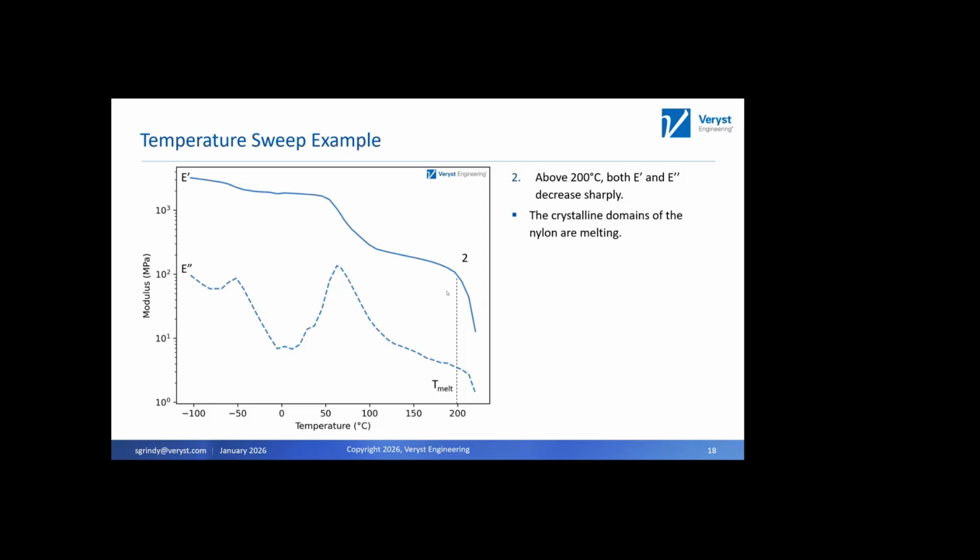It's only when you're doing very, very thin or very compliant materials that you start to have inertial effects that start to wash out your signal. So at higher frequencies as well is where that's a problem. But that tends to be, in my experience, what I'm going to call more exotic materials than standard polymer materials.